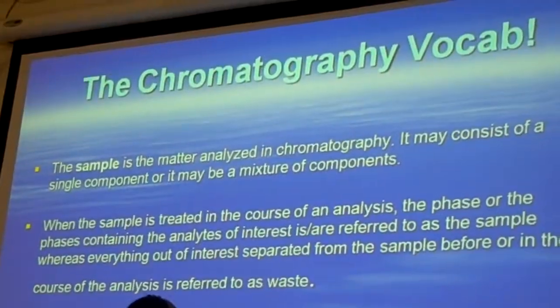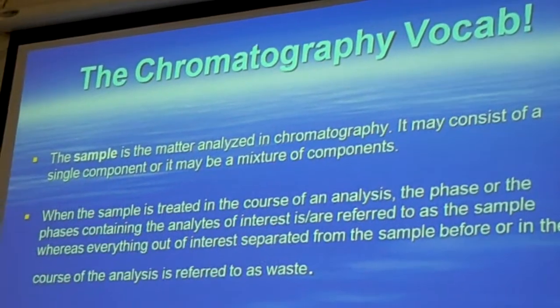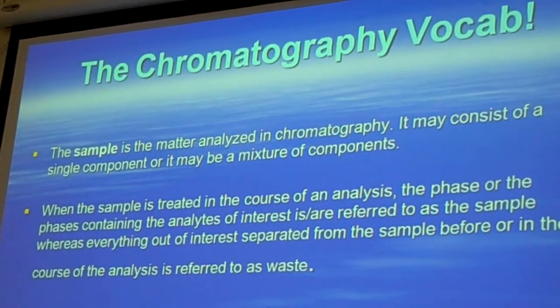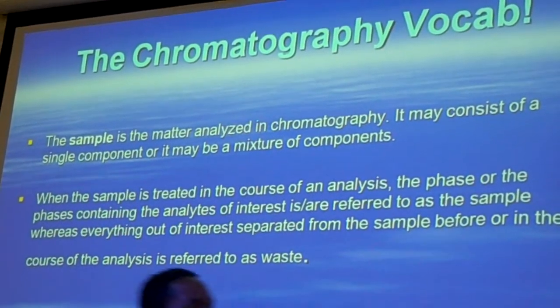And the sample is the matter being analyzed, when the sample is being treated, the analysis, the phases. Okay. The rest is referred to as waste.